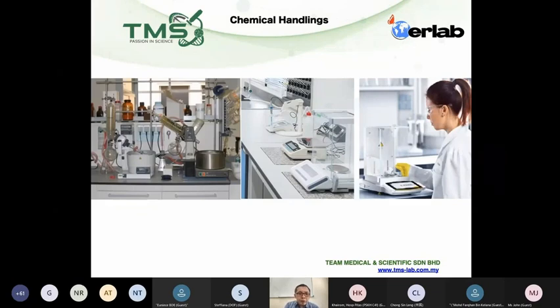And sometimes we also see certain equipment we put on the bench that generates vapors. Or occasionally we'll see measurements of toxic powders at the open bench. That is also a concern. Of course, if you measure DCM, the dehydrated culture media, it is still fine. But if you are measuring carcinogenic powder, then maybe you should do something about that, right?